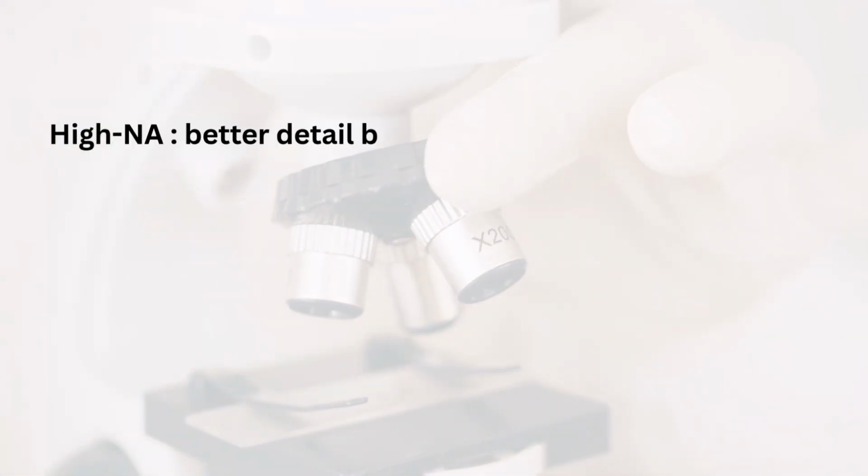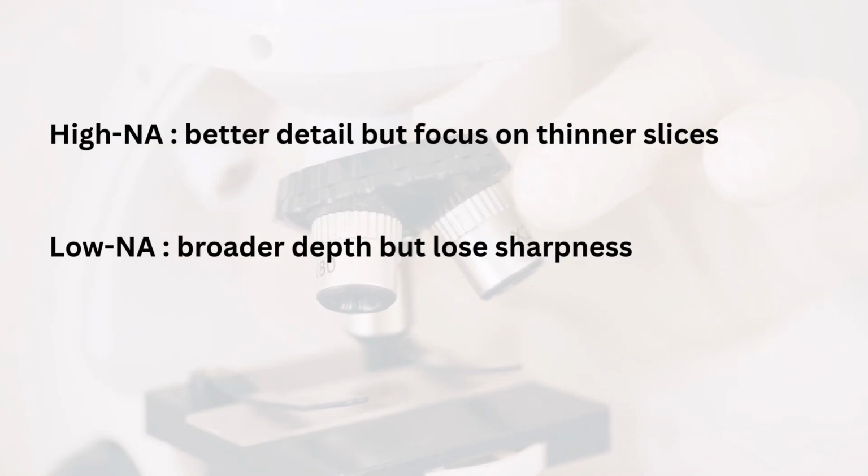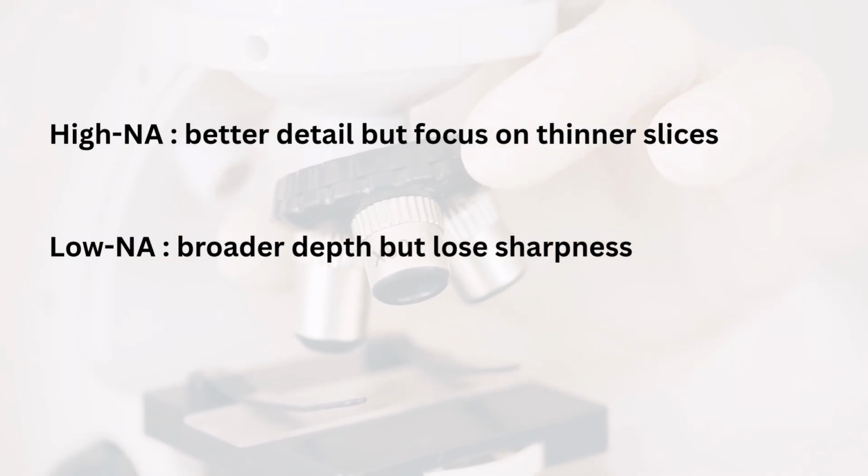So, high numerical aperture lenses generally give better detail but focus on thinner slices, while low numerical aperture lenses capture broader depth but they lose the sharpness.